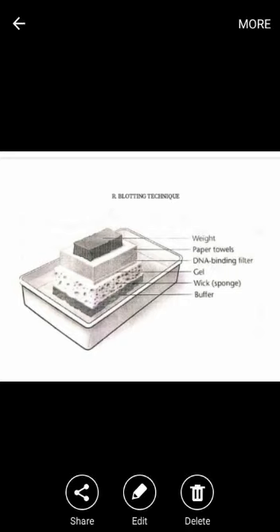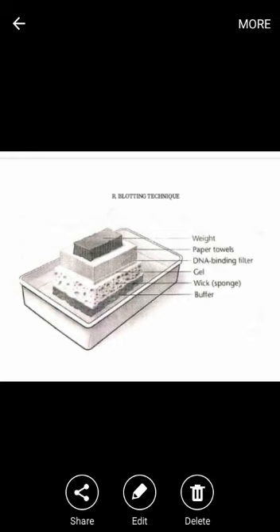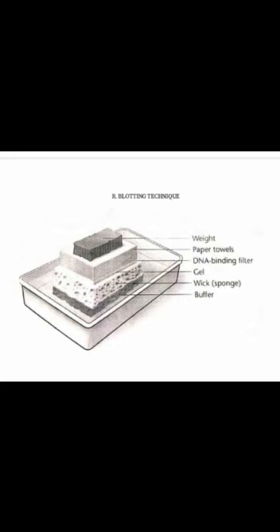After this, the DNA is denatured by exposure to mild alkali and transferred to nitrocellulose or nylon paper, resulting in an exact replica of the pattern on the gel. The DNA is bound to the paper by exposure to heat or UV radiation, and the paper is then exposed to the labeled cDNA probe, which hybridizes to the complementary fragment on the filter.